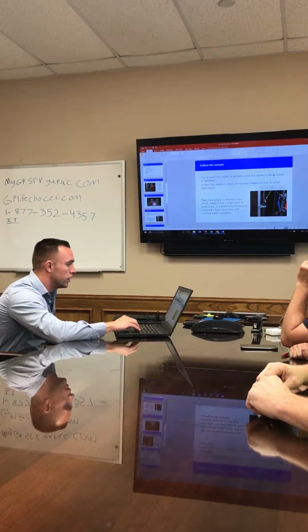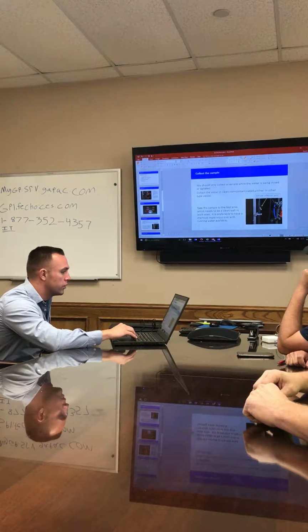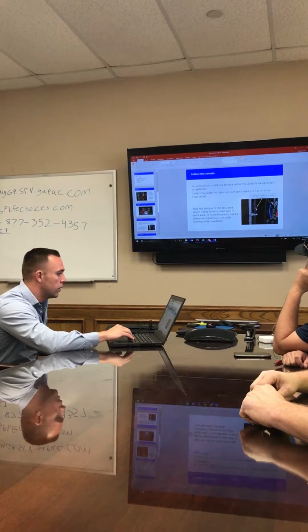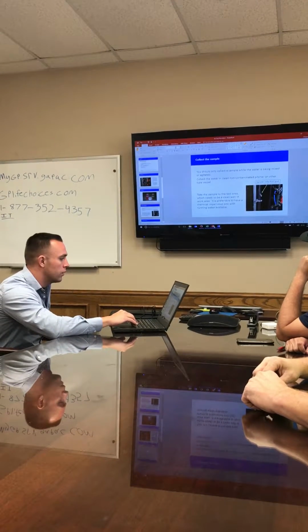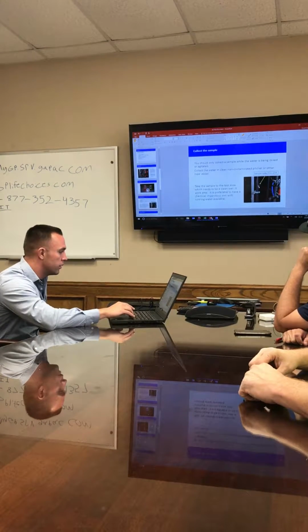Alright. You should only collect the sample while the water is being mixed or agitated. Collect the water in a clean, non-contaminated pitcher or other type of vessel. Take the sample to the test area, which needs to be a clean, well-lit work area. It is preferable to have a chemical impervious sink with running water available. And you guys have that back there, so there's no problems with that.